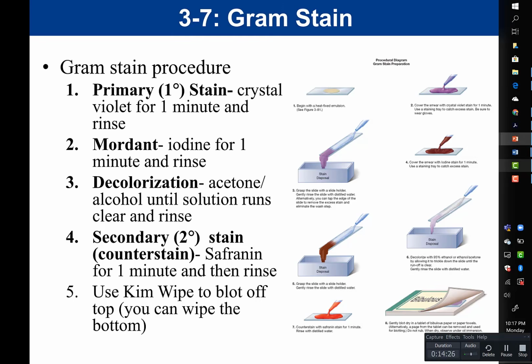You want to know that for the decolorization step, you're going to use an acetone alcohol solution until the solution coming off runs clear. Again, that step is not 1 minute. It's simply until the liquid coming off is clear.